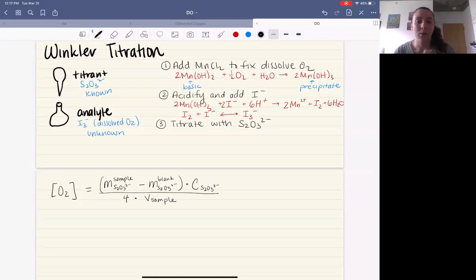Okay, so notice we're dividing by volume in order to get a concentration in molarity, I believe. And that's why it becomes super useful for us to have used a BOD bottle, since the BOD bottle is made for this, of having a consistent volume measurement every time. That volume will be a constant. And you should have determined that volume of your BOD bottle back in the density and salinity experiment.